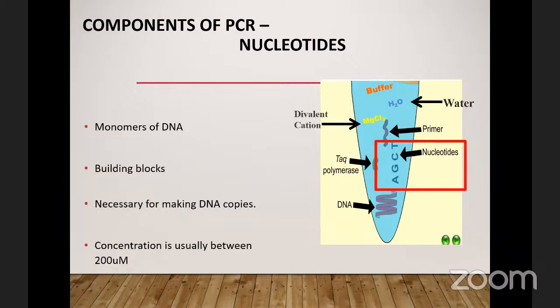Remember, like I said, those nucleotides, adenine, A, T, G, C, that you used to see written in stretches when we are writing the figures of DNA, right? Single nucleotides are part of this setup. So we call them dNTPs, deoxynucleotide triphosphate.